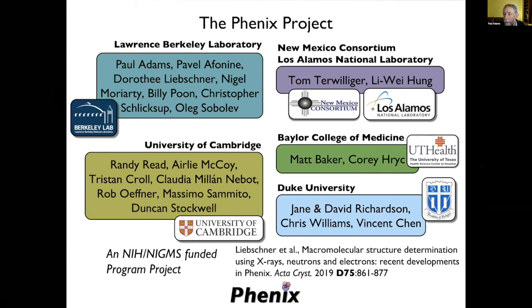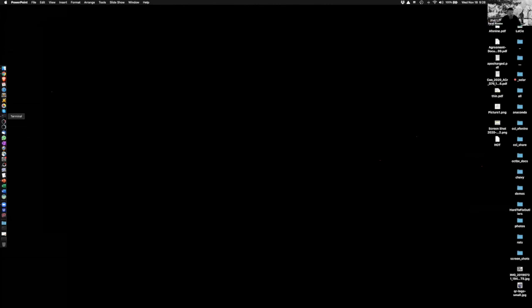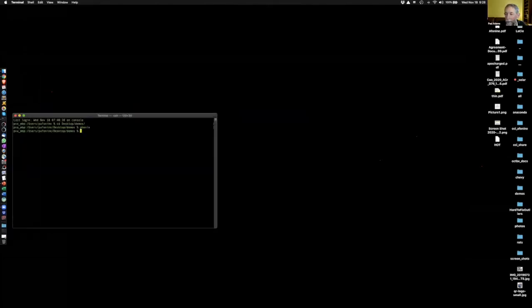So just looking here. Okay, so I think that's it for questions right now. So maybe you want to just go through a few quick demos, Pavel, and then we'll move on to Nigel. And we'll come back to some of these occupancy questions, I imagine. Sure. Yeah, let's do it. Am I still sharing, right? Yes. Wonderful.